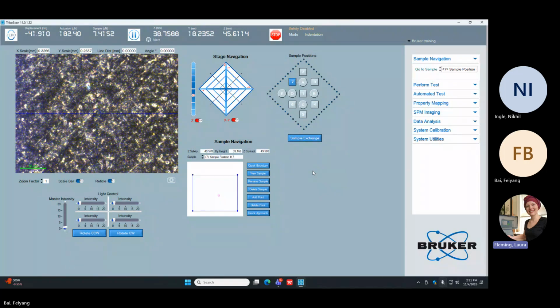There are other ways to cheat. You can add a little Sharpie mark on part of it so that you can focus on the ink. But in general, this is really great for those kinds of samples. It would have been great for the fused quartz. You remember how hard it was to focus there. It would have been much nicer to perform this motion instead.